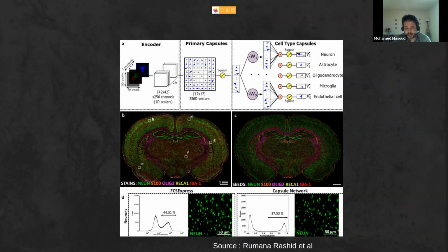So they tried to use a type of network here, which is the capsule network.